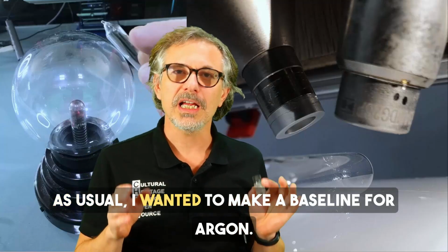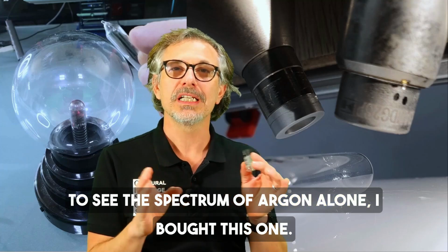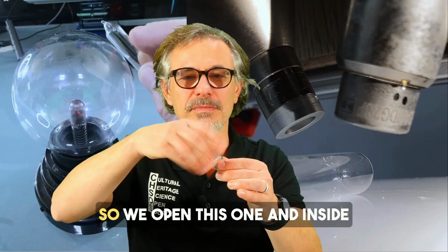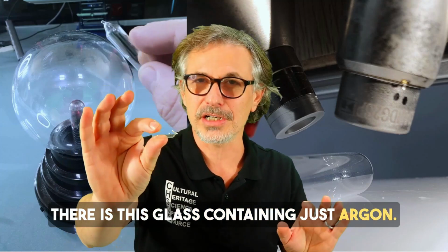As usual, I wanted to make a baseline for argon to see the spectrum of argon alone. I bought this argon vial; we open this one and inside there is a glass containing just argon.